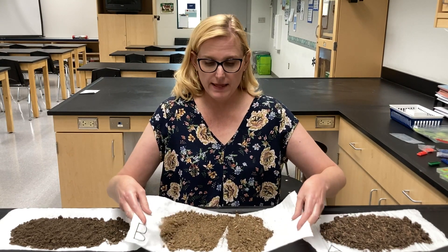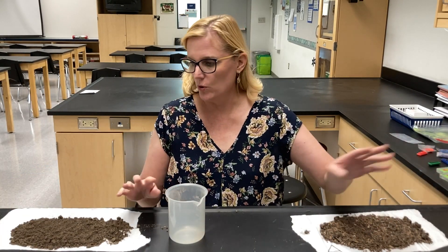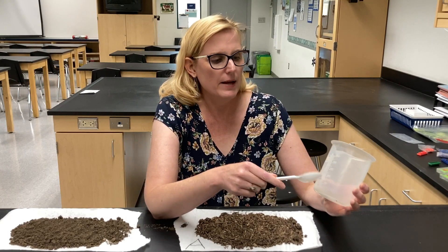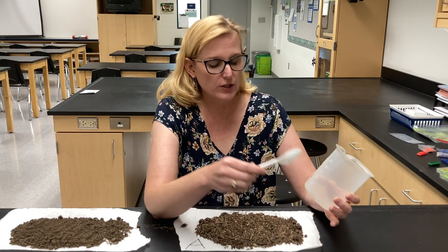We're going to take them and mix them with one part soil to five parts water. I'm going to fill it up to about 100 milliliters of soil.